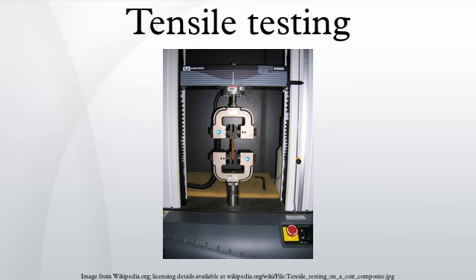The repeatability of a testing machine can be found by using special test specimens meticulously made to be as similar as possible. A standard specimen is prepared in a round or a square section along the gauge length, depending on the standard used. Both ends of the specimens should have sufficient length and a surface condition such that they are firmly gripped during testing. The initial gauge length is standardized and varies with the diameter or the cross-sectional area of the specimen as listed. The following tables give examples of test specimen dimensions and tolerances per standard ASTM E8.